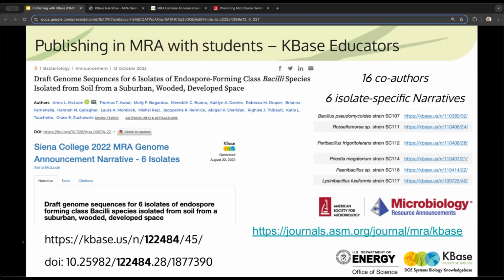So this is one example with ASM-MRA, and we actually have a really great partnership with them where KBase has been set up as a repository. And now we also, for those of you who do teach and are interested in using KBase with your students, we have a KBase educator, I guess it should be educator and students because these students are also authors. We have a special collection with MRA, and I'll show you that page in a little bit.